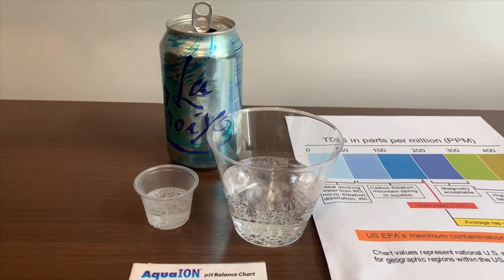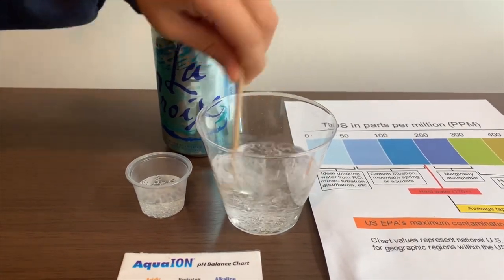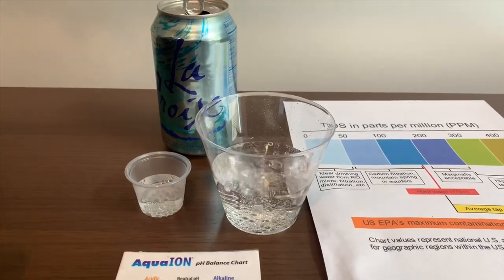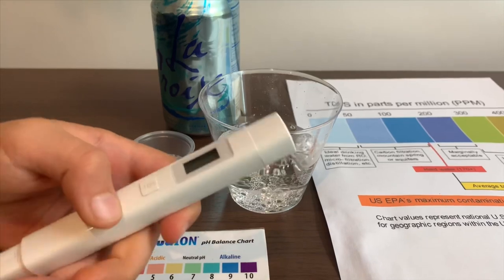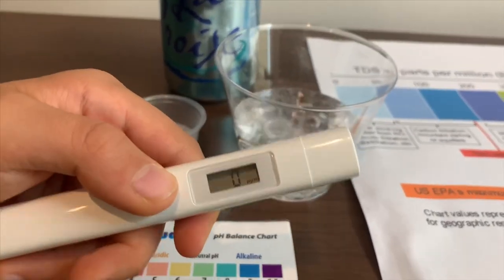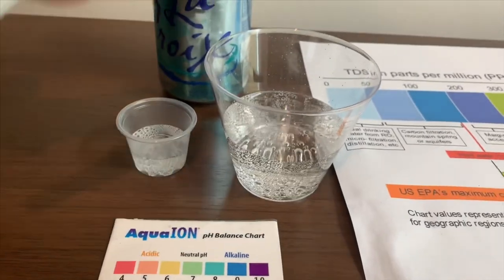First, let's test the TDS levels, but let's stir it a little so we'll get a better result. If you want to buy this TDS tester, check the link down below. Turn on the TDS tester, make sure it says zero, and put it in.